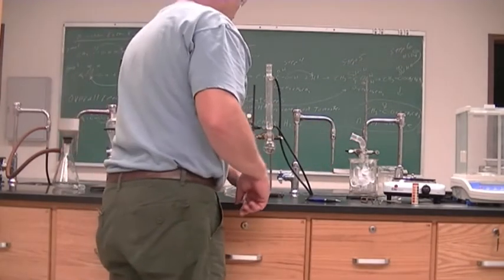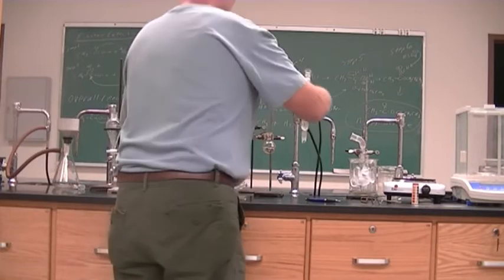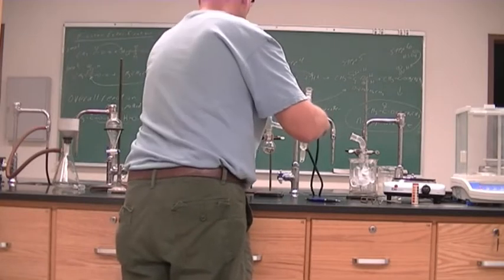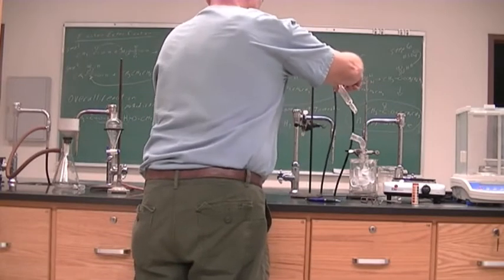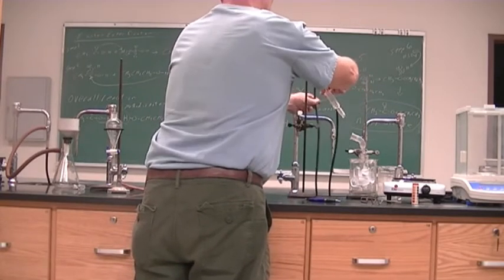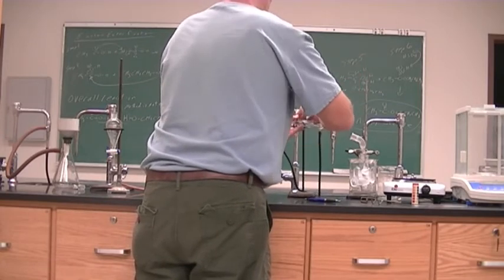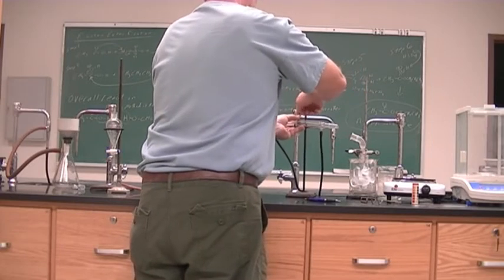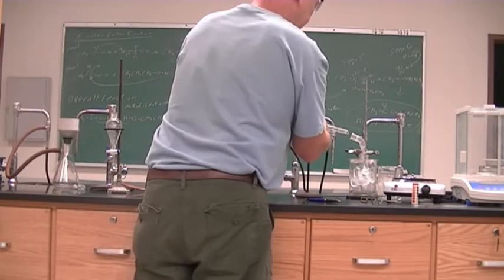All right, and so now I'm ready to get my condenser connected over here. That's going to go there. A little bit of engineering going on here. All right, so now I got to get this to match up here.